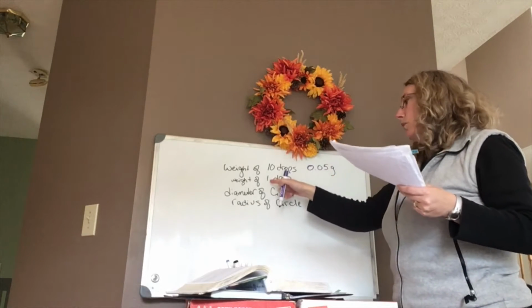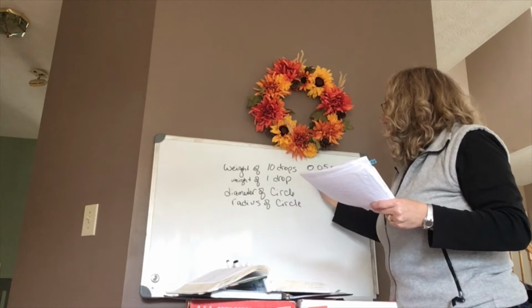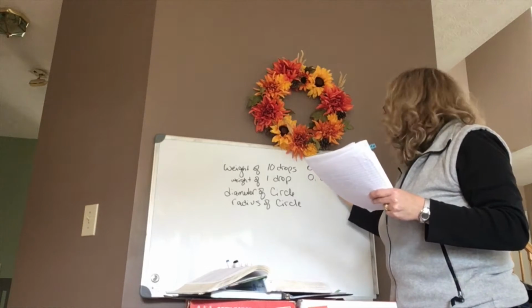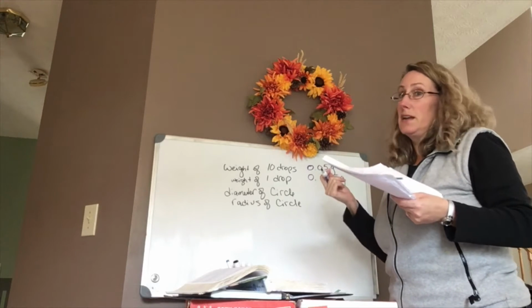So if you want the weight of one drop, you just divide that number by 10 or move your decimal place over. So the weight of one drop would be 0.005 grams. So just adding another 0.